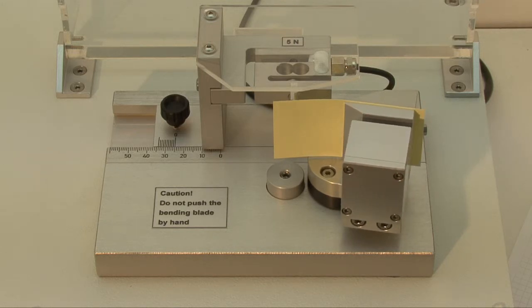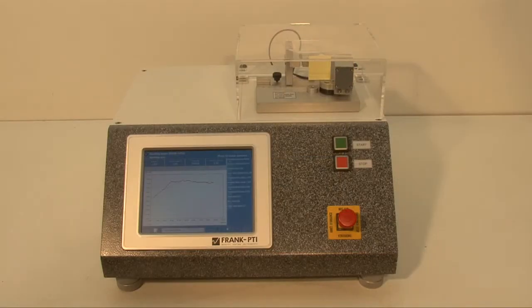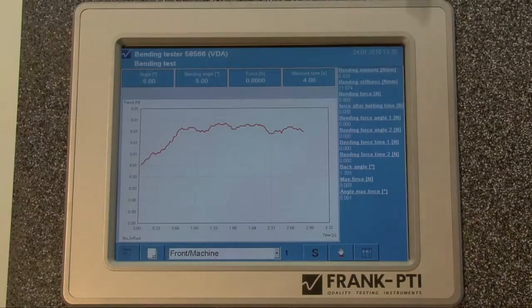The test will be done automatically and on the screen you will see the results in the form of a curve, like here.